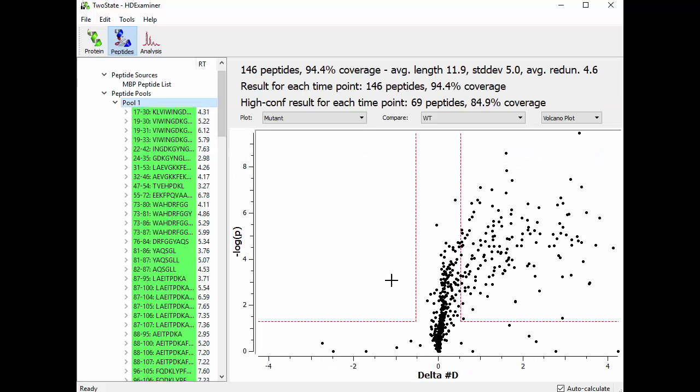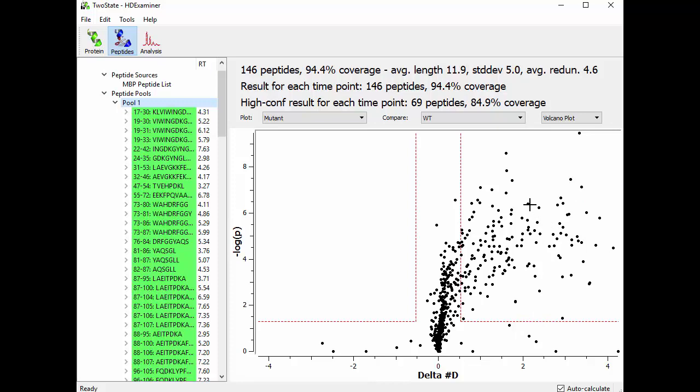What are the X and Y axes here? Well, so the X axis is delta number D for this peptide at this time point between the mutant and wild type states. So this peptide, for example, we're looking at 226 to 235 at the four hour time point, and we can see that the delta number D is 2.121. So it's a pretty big difference.